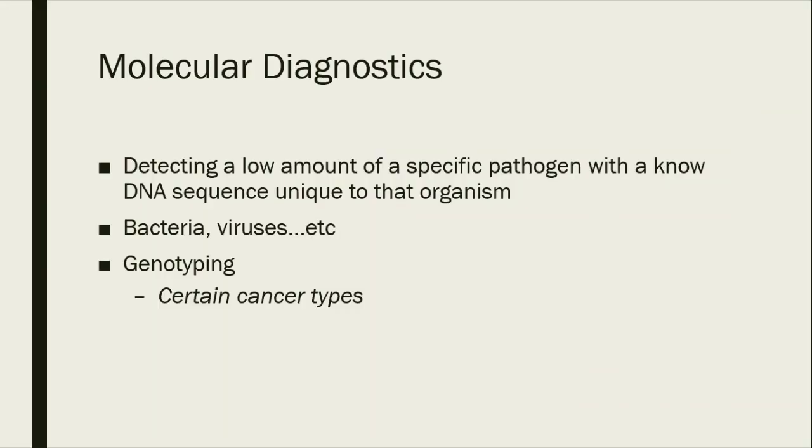Right. So what can you use PCR for, beyond checking that your plasmid has the right gene in there? It is to use it as a molecular diagnostic tool.